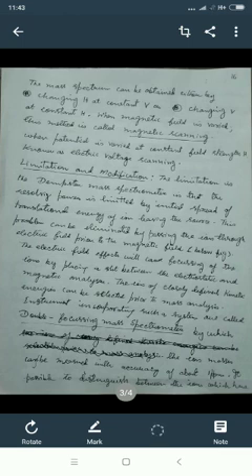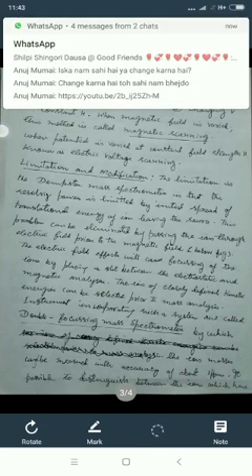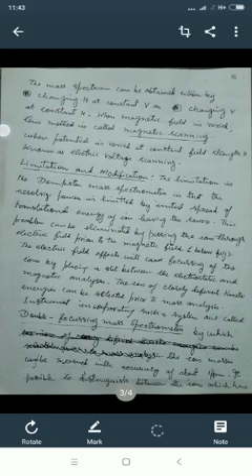Now the limitation and modification of this method. The limitation of the Dempster mass spectrometer is that the resolving power is limited by the initial spread of translational energy of ions leaving the source. This problem can be eliminated by passing the ions through an electric field prior to the magnetic field, as shown in the diagram. The electric field will cause focusing of the ions by placing a slit between the electrostatic and the magnetic analyzer. The ions of closely defined kinetic energy can be selected prior to the mass analysis.